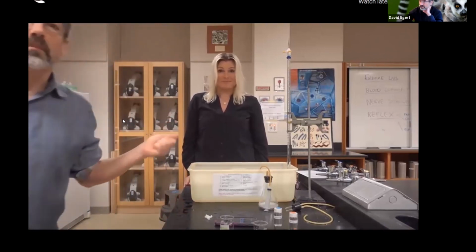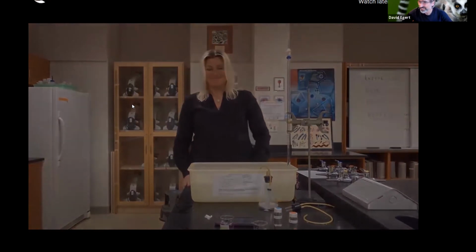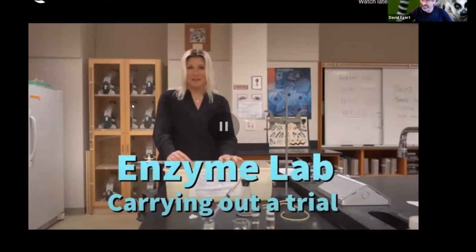But that was awesome. Yeah, and she makes it look easy there, but it really can be tricky trying to read those numbers off as the bubbles are coming up, and the 5 seconds comes up so fast. Typically, we end up having groups get started and then have to just set it all up and start again.